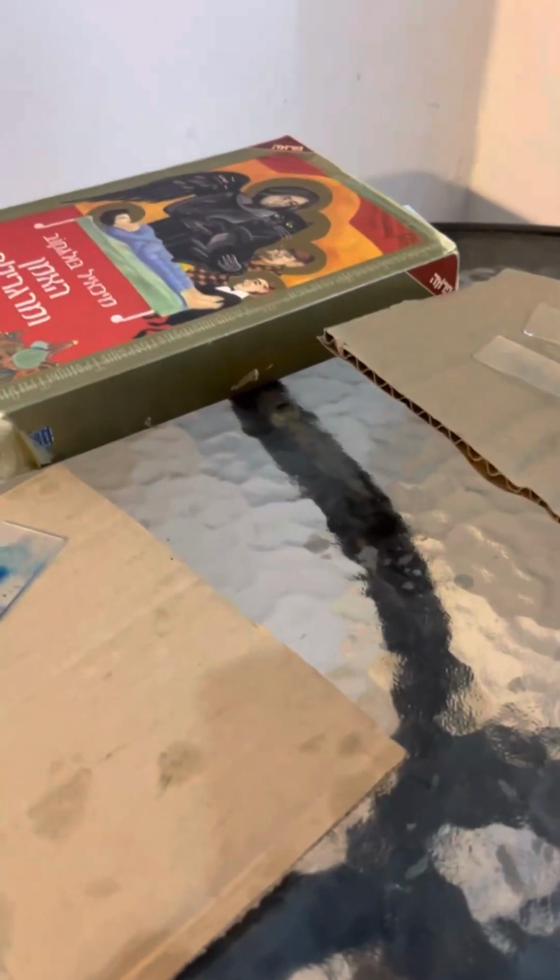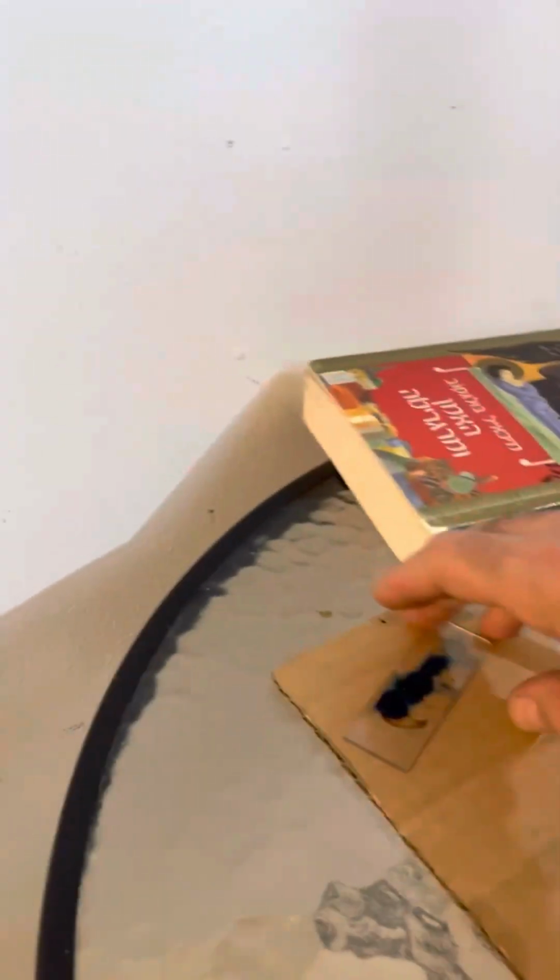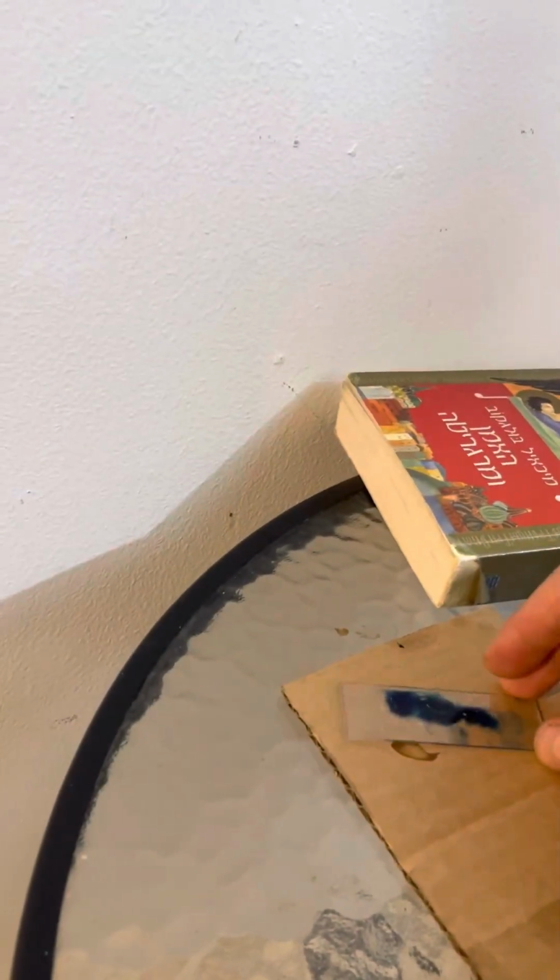So generally, we will see. We will be able to identify much less stuff than before, in the previous slides, and also in the next two slides, which are not from this blue ocean, this blue thing. But maybe someone can help tell us what we actually see.